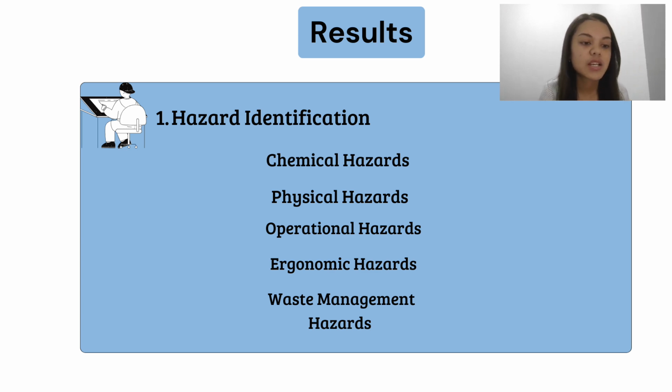The fourth is ergonomic hazards. Physical strain brought on by extended standing or sitting or repetitive duties. The sources of hazard are spending a lot of time watching jar testing and repeated manual labor such as mixing or pipetting, and the control measures are ergonomic chairs or movable stools, plan frequent pauses, and implement automation for routine tasks.